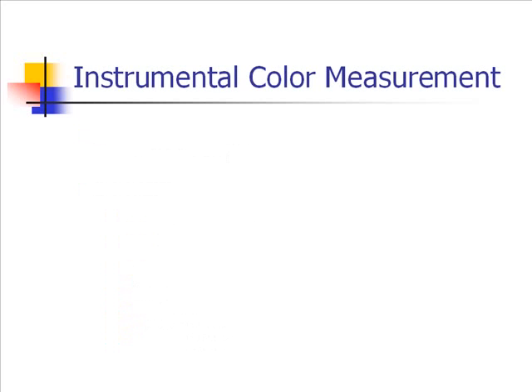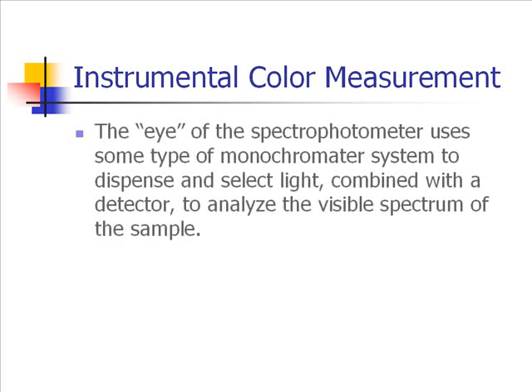You know, the instruments are great, and they do a great job of measuring what you give them, but if you don't present the sample right, or it's not a good sample like I mentioned before, it's not going to give you good results. So when people look at numbers, unfortunately, they treat them like they're absolutely right, even though they may come from a bad source. You know, the old adage about computers, garbage in, garbage out. The computer does what it's supposed to, but if you give it bad data, it can't come up with the right answer.